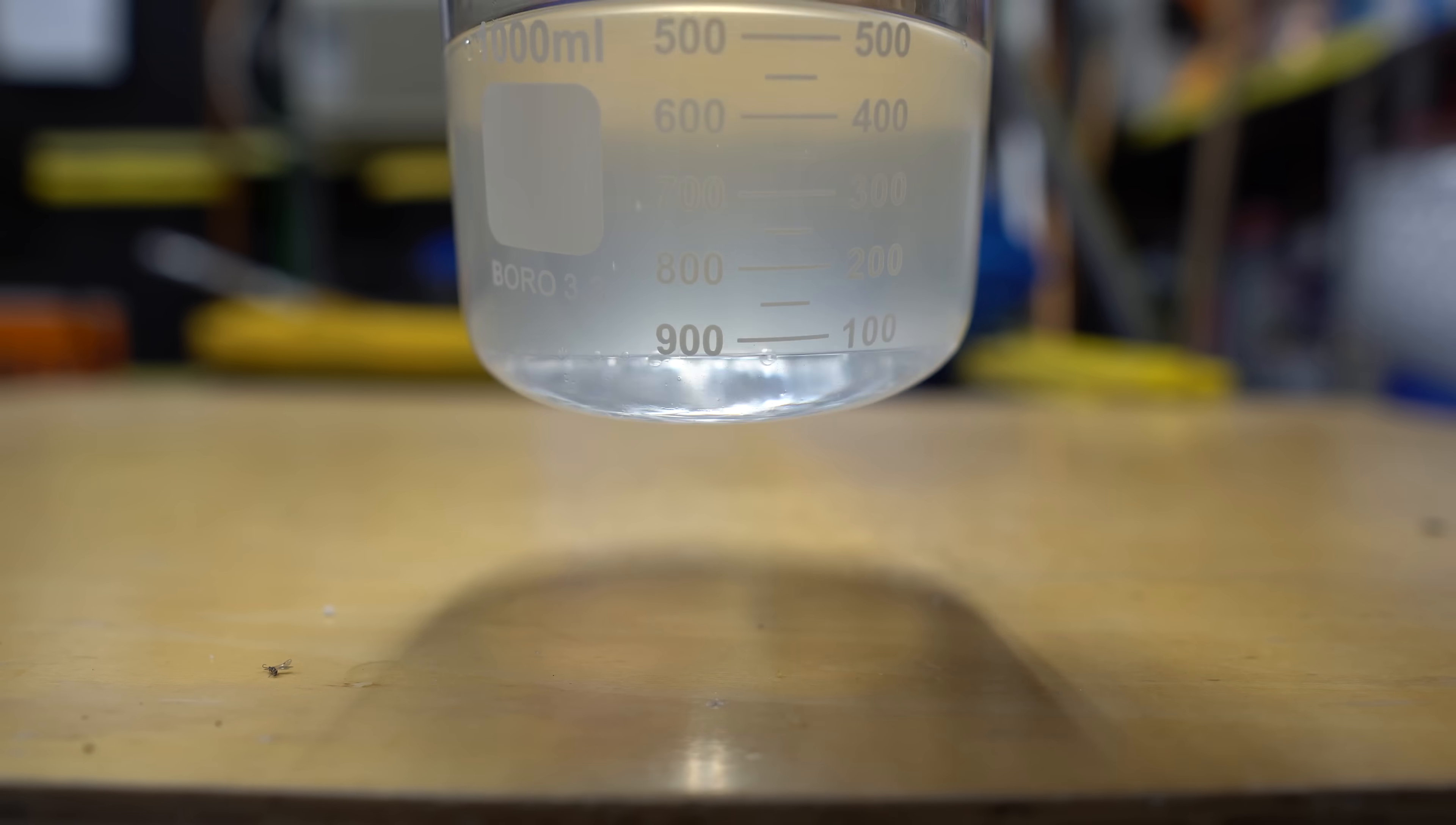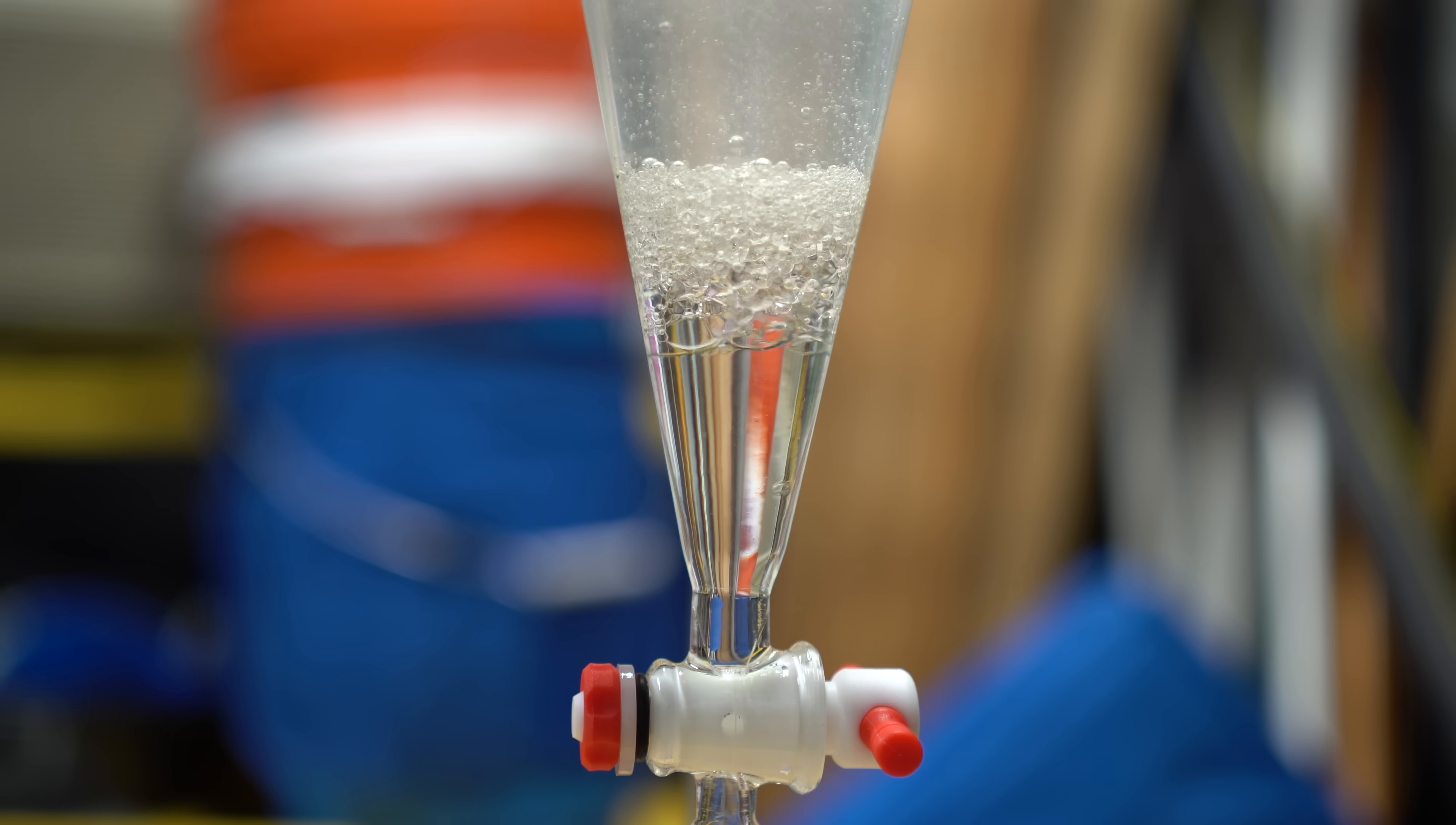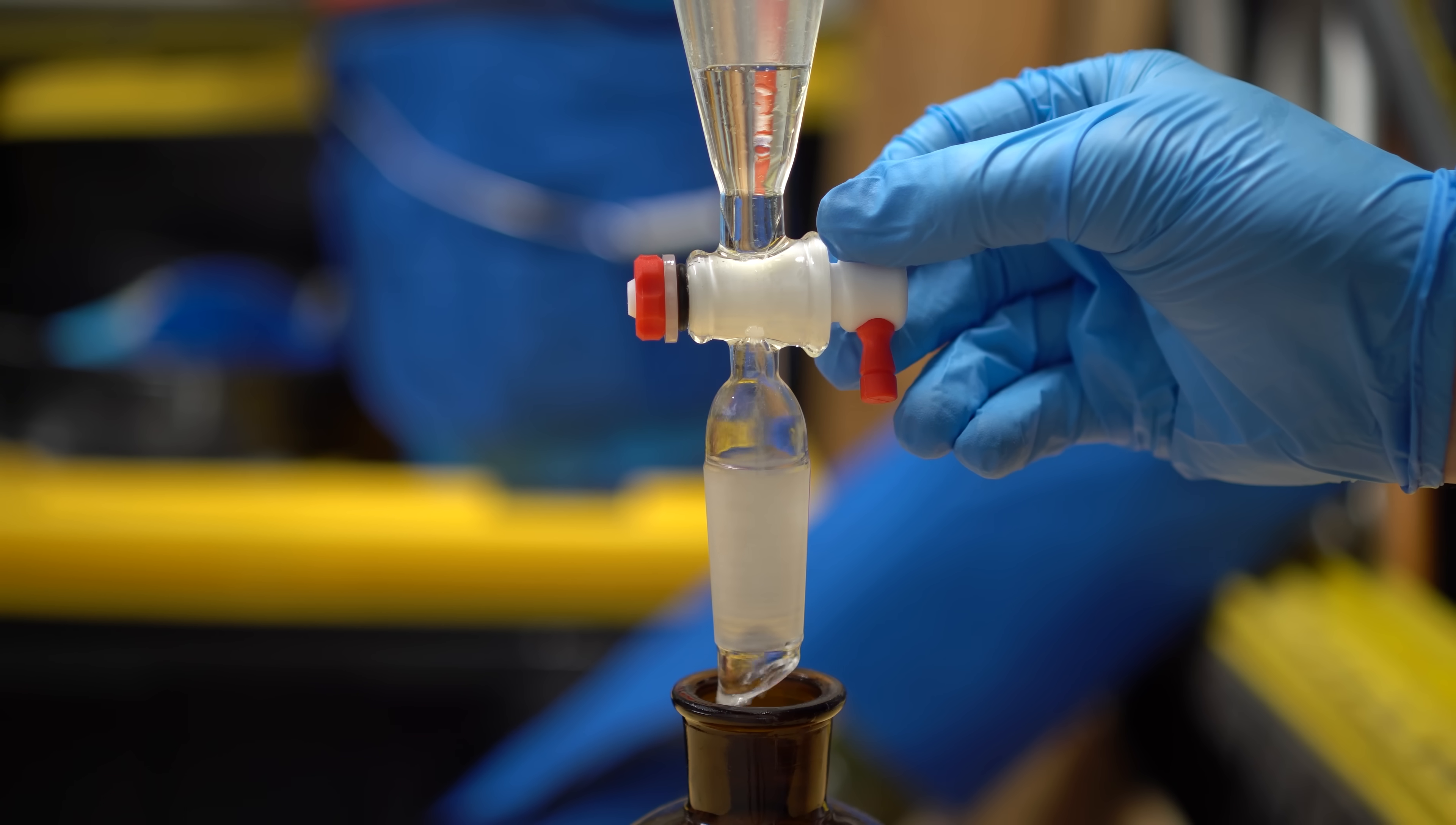Again, chloroform is a lot more dense than the bleach solution, so everything should be on the bottom, ready to be separated again in the separatory funnel. Please do not judge me for the actions you're about to see right now. This is definitely the worst way that I could have set this up. Just like before, we're going to fully drain the bottom layer and collect that into a glass vial, and then we're going to add anhydrous magnesium sulfate to fully dry the chloroform.